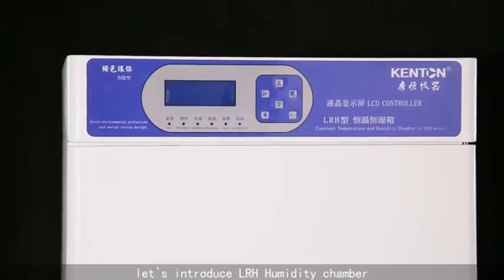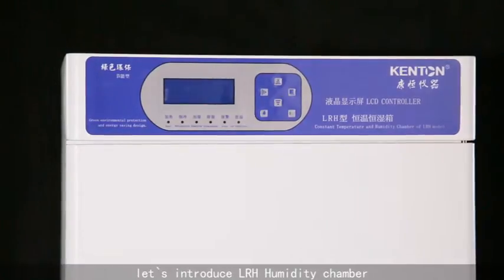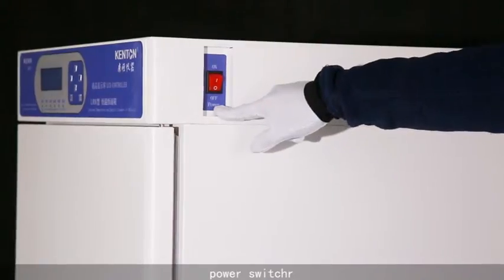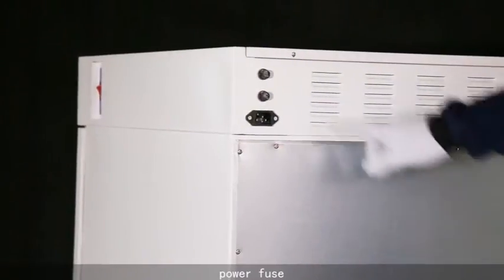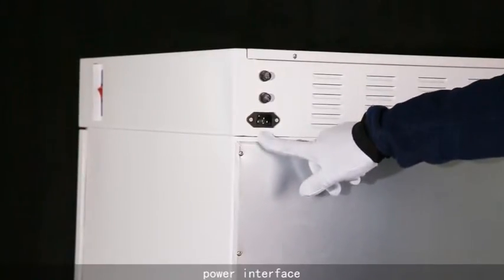Hello, everyone. Let's introduce the LRH humidity chamber: power switch, power fuse, and power interface.